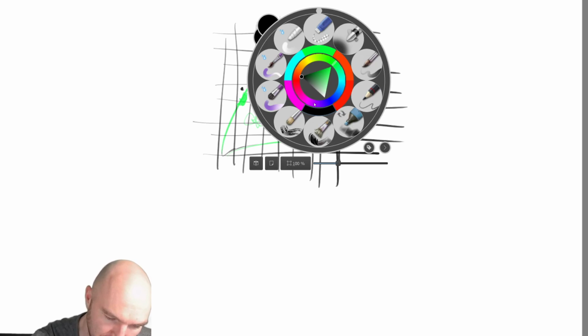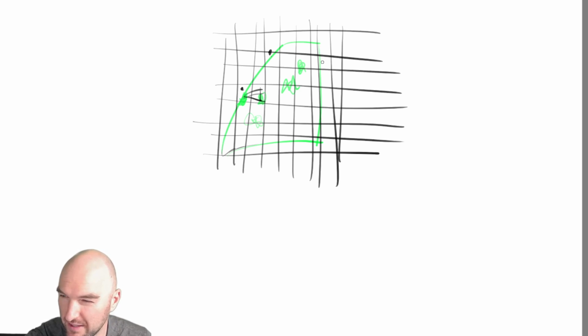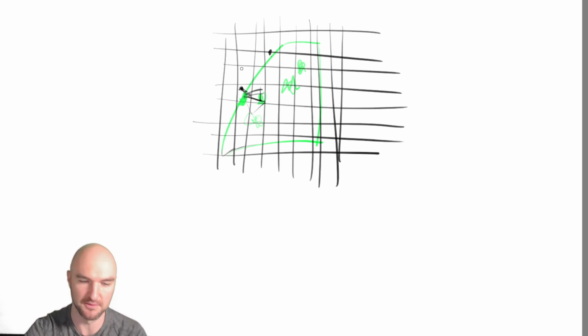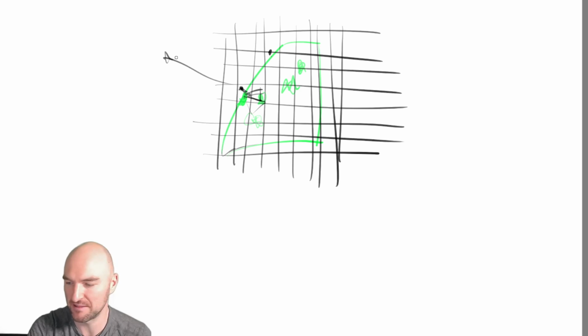But the tetrahedra that we've built are actually all inside by definition, because we took a sample of 100,000 atoms out of, in this case, about, I think, 20 million or whatever the data set size is, and built tetrahedra based on them. And sometimes we are going to be unlucky, and one of those vertices is going to be relatively far away from any of those vertices. And so we might run into numerical issues where the closest tetrahedron is relatively far away and at a very shallow angle. And then this thing is just going to be projected somewhere off into the distance.